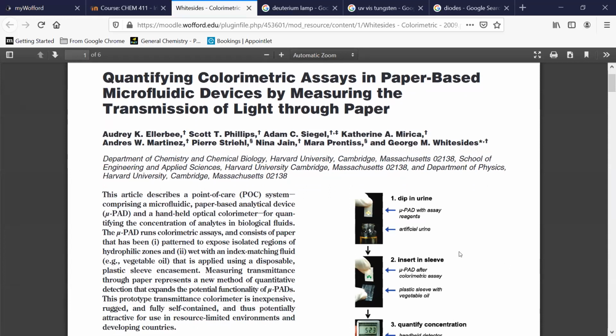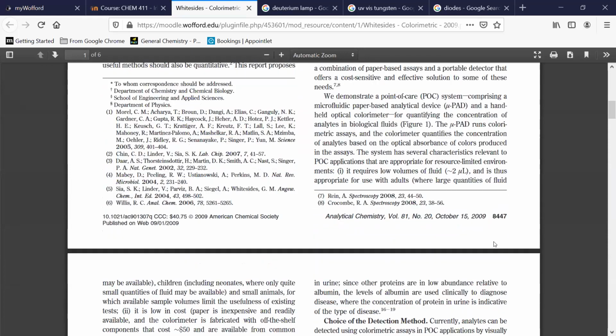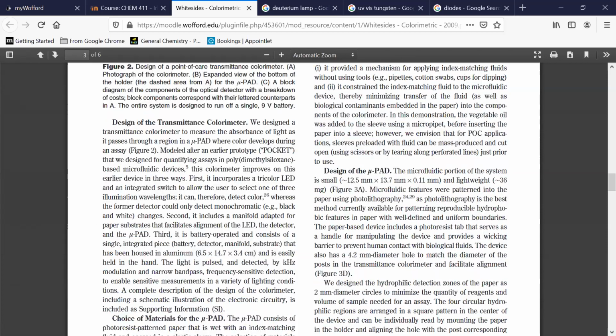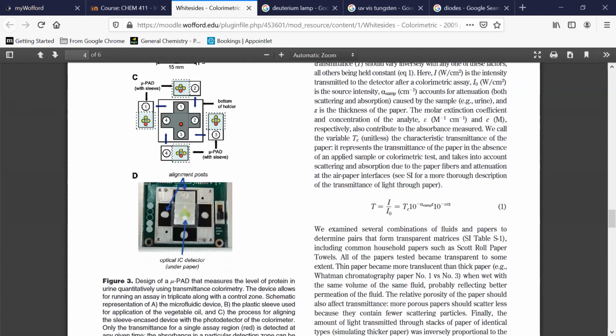And so this paper is talking about a very simple instrument. It has a couple LEDs that will tell you the concentration of whatever it is in your urine sample. Anybody can look at the LEDs and the screen and write down a number and see if it's in the range or out of the range, right? A very easy instrumentation. So it's a really neat paper.